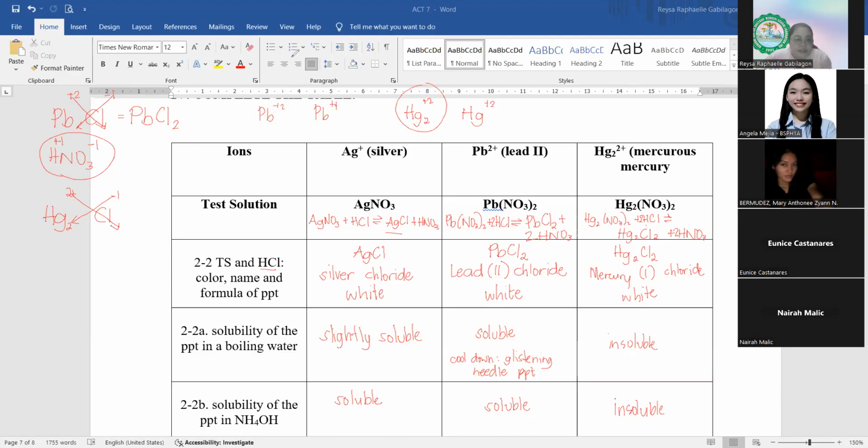Wala nag-precipitate ang silver nitrate niyo? Dapat mag-precipitate talaga yan, kasi kagaya ng inyong silver nitrate dito plus HCl, kagaya lang ito ng activity number 6. So, dapat mag-precipitate talaga yon. Ano kaya ang nangyari? Ba't hindi siya nag-precipitate?